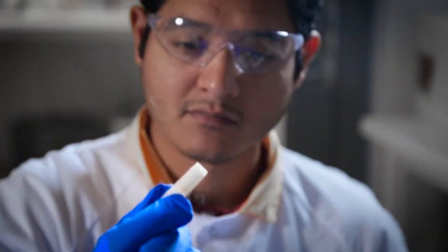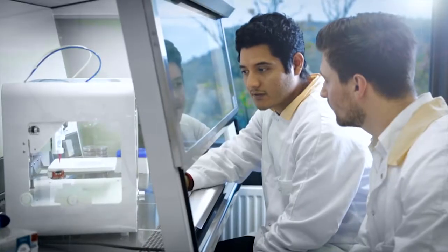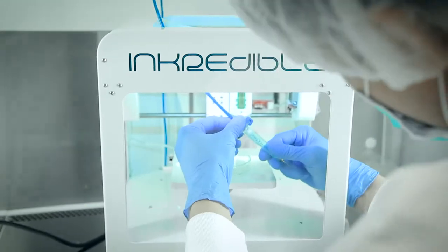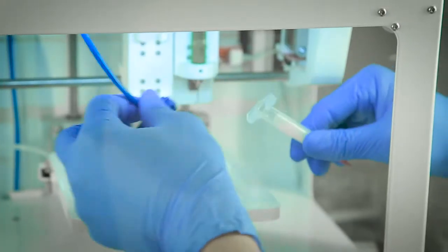But with Cellink's cost-effective solution, we can reach out to a wider customer base, which allows more researchers around the world to get access to 3D bioprinting.